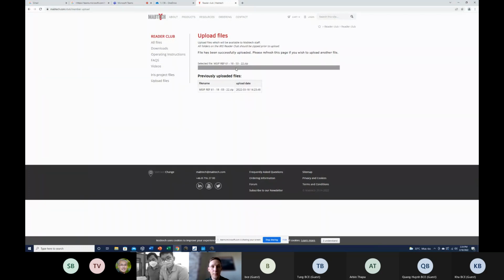So this is the process that you're doing. Then the next time you're moving the instrument, you need to read it one time on the instrument before you ship, and then you read it again when it's been placed at the customer site. Mm-hmm. Yeah. Okay.